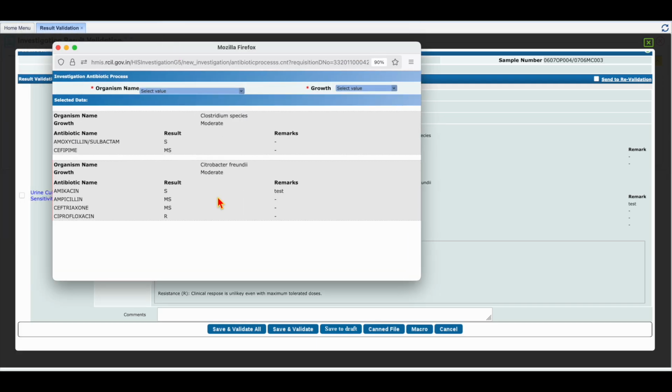In this pop-up you can find the results that were already entered. So here we're finding the edit button. To edit this one, you have to select the organism for which the result was entered, edit, insert or update anything for this organism. Select the same organism here.